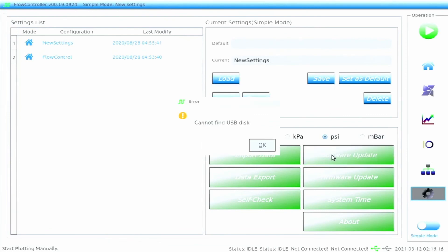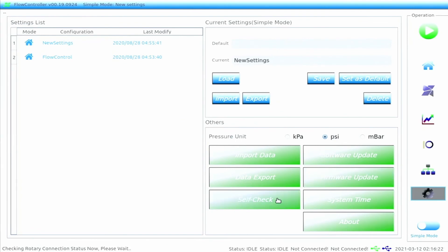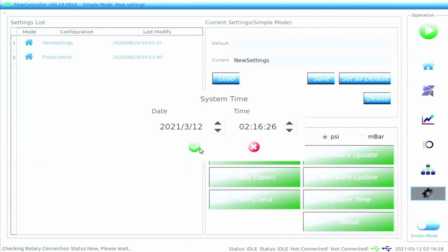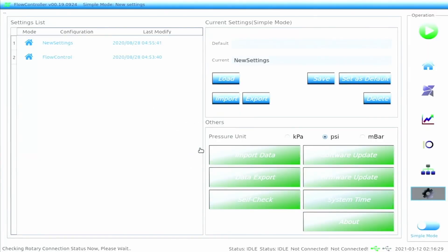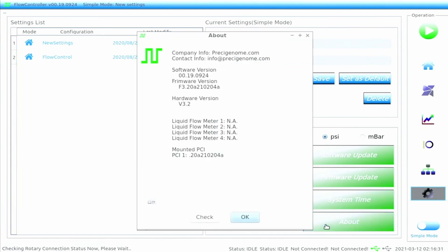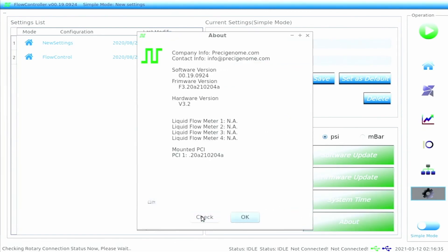The user can also perform software and hardware updates, perform a self-check which tests to see if any external devices are connected, change the system time, and read the about profile, which can be refreshed via the check button to see what devices are currently connected.